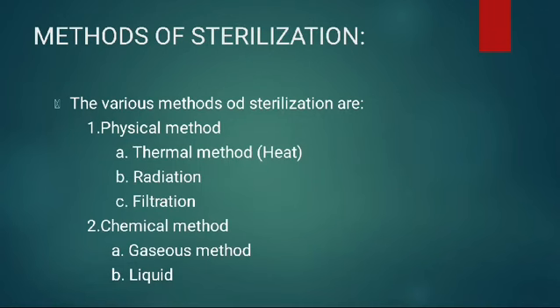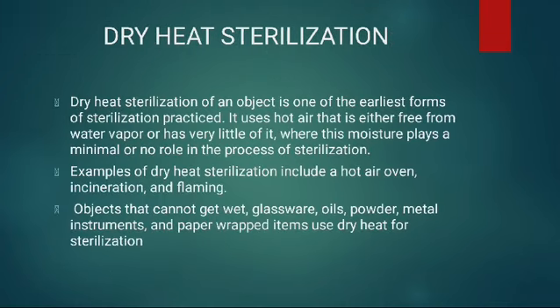Methods of sterilization. The various methods are as follows. The first one is the physical method. It is classified further into thermal method, radiation and filtration. The second one is the chemical method. It is classified into gaseous method and liquid method.